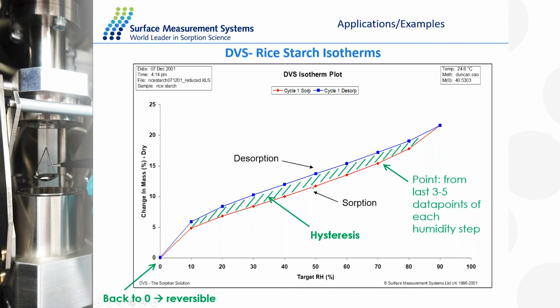There is a nice hysteresis gap here, which means that the molecules will come in and then they will have to migrate out. They require more energy during the desorption rather than absorption, which means basically that there is a bulk absorption phenomenon here. I need to provide more energy for the molecules of water to come out of the sample rather than during the absorption stage, which is the initial line over here. So this is a nice set of information.